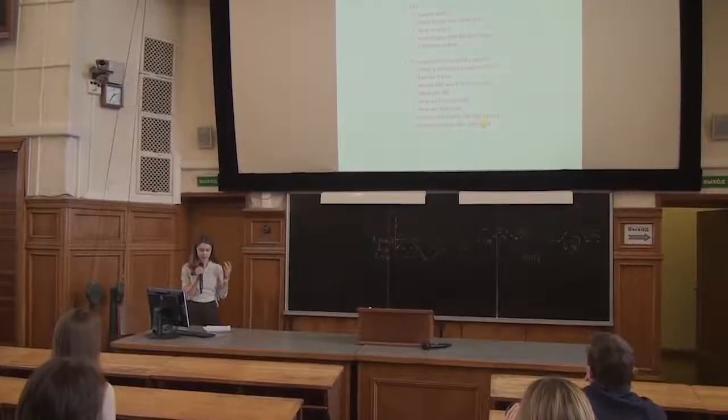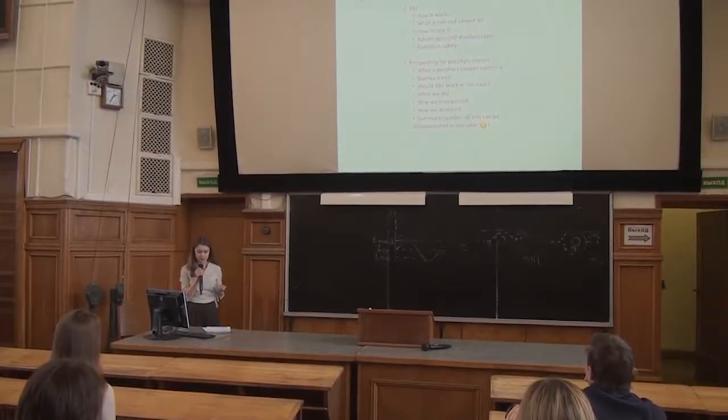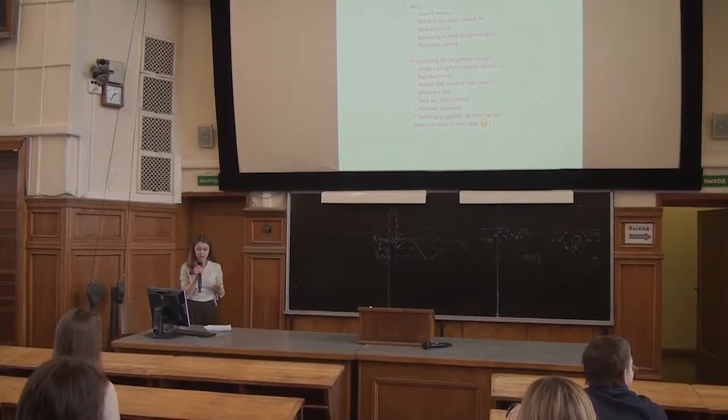My today's lecture is going to be on usage of state-of-the-art analyzers for prospecting of porphyry copper deposits. You're welcome. Here is a brief overview of what my presentation is going to be about. I'll start with a section on X-ray fluorescence. It's not the only portable analytical method being used in exploration nowadays, but I'm going to focus on it mostly.